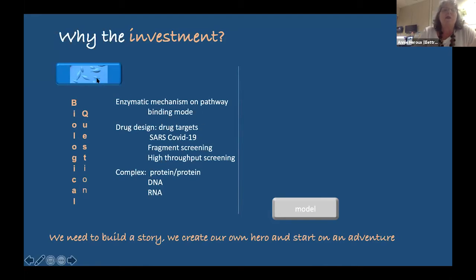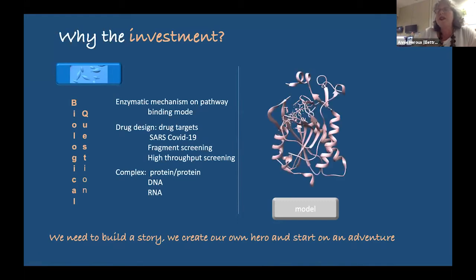So you want to go from crystal to a model. And unlike other disciplines where you have a priceless artifact, or a sample that is already there and you want to study, in the MX world you need to create your sample from nothing, from a sequence, basically. And the steps are very long, time consuming and energy consuming before getting to the synchrotron. And the synchrotron part is actually a very short time in your experiment.